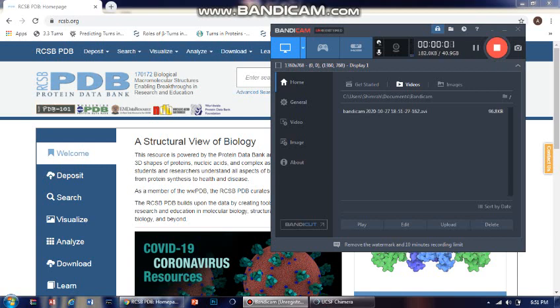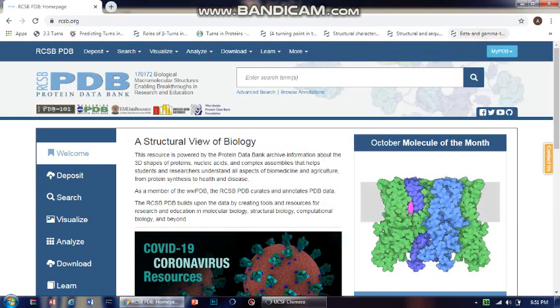Hello everyone, I hope you are doing very well. I have decided to start a series of videos on using UCSF Chimera for bioinformatics — for visualizing proteins, structure minimization, energy minimization, and so on. To start with the software tool, we should know the basics first.